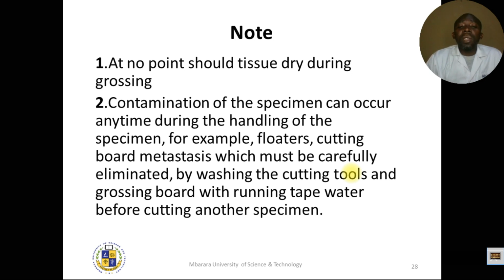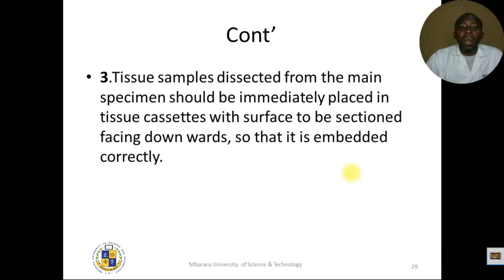In the end, a person who doesn't have cancer may be diagnosed with cancer when it was actually a result of not cleaning, and it came from the board. What we call the board metastasis. It moved from the board into the tissue of a negative person, and this person is diagnosed wrongly and declared to have cancer, which is not proper.